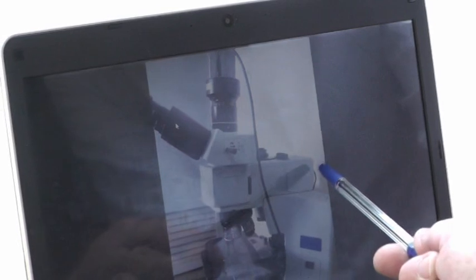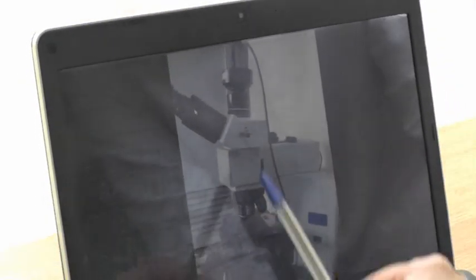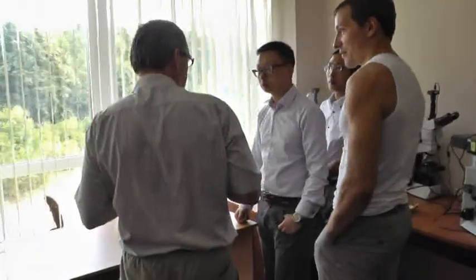Here you have an LED as a light source, as I understand, and some beam splitter is mounted. Yes, it's transparent, and some part of the light from the objective, from the sample, will pass through. But I cannot give any warranty that we will not have additional problems with our useful light.